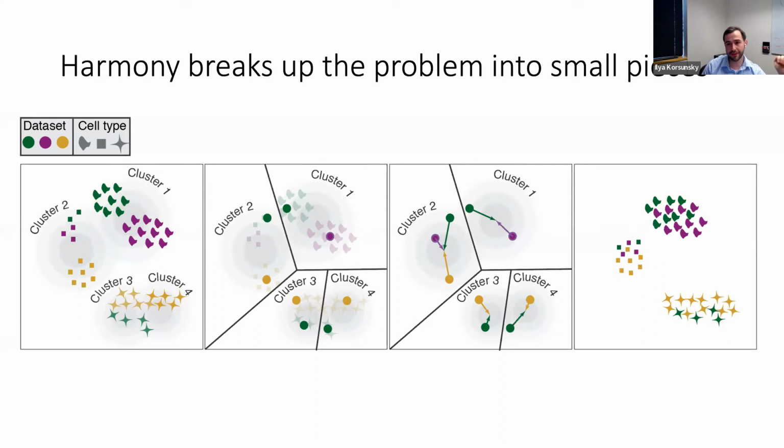And so all of these tasks can be done with that. Oh, and there's actually a family of algorithms that we didn't really even touch on, but that do case control analysis without clustering, right? So I'll put a plug for this CNA algorithm, covarying neighborhood analysis. I think that's one where Harmony has been very useful for us. I would check that out as another use case for after integration.